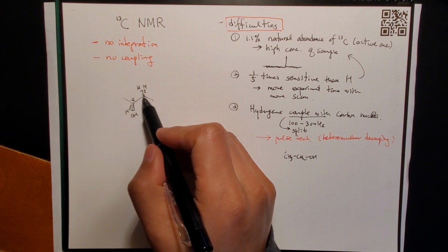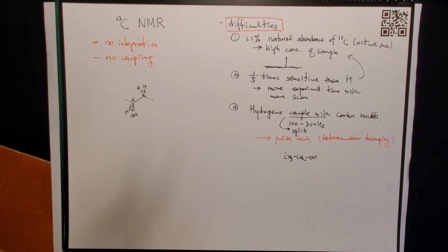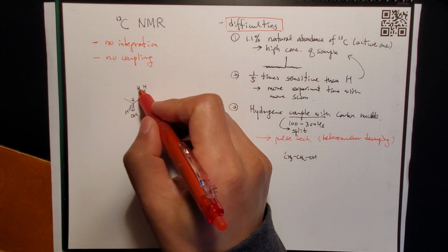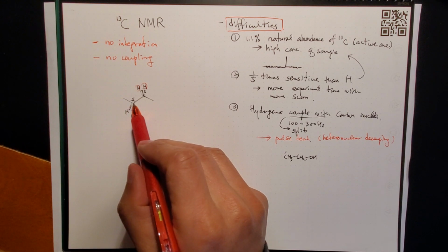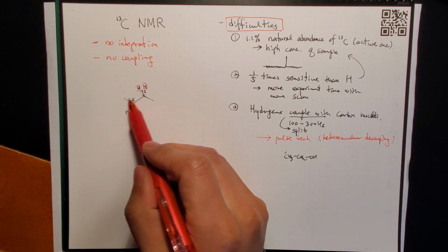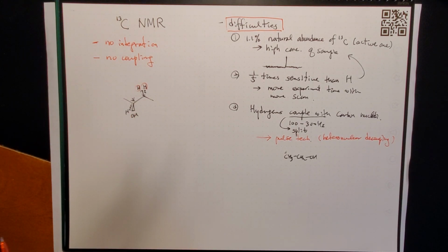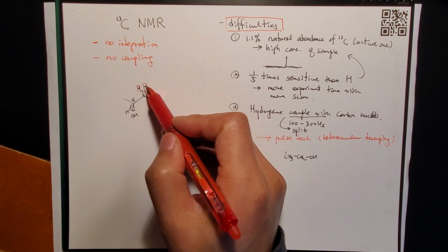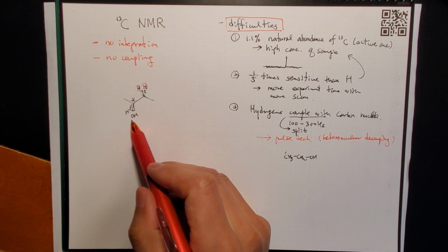And even for two hydrogens next door, it doesn't have to be next door, but in the molecule, if you have a hydrogen that's not really on the chiral carbon, but due to the chiral environment, this hydrogen feels a different local magnetic field compared to the other one that is closer to the hydrogen, not OH, right?